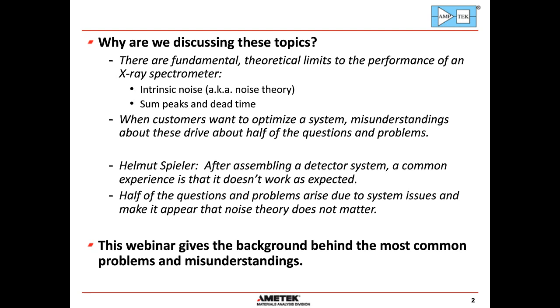The other thing is, Helmut Spieler, a scientist from Berkeley, once famously said, after assembling a radiation detector system, a common experience is that it doesn't work as expected. Half of the questions and problems that customers have arise due to system and system integration issues, and they make it appear that the noise theory doesn't matter. So that's why we want to talk about it as well. So this webinar will give the background behind the most common problems, misunderstandings, and limits.